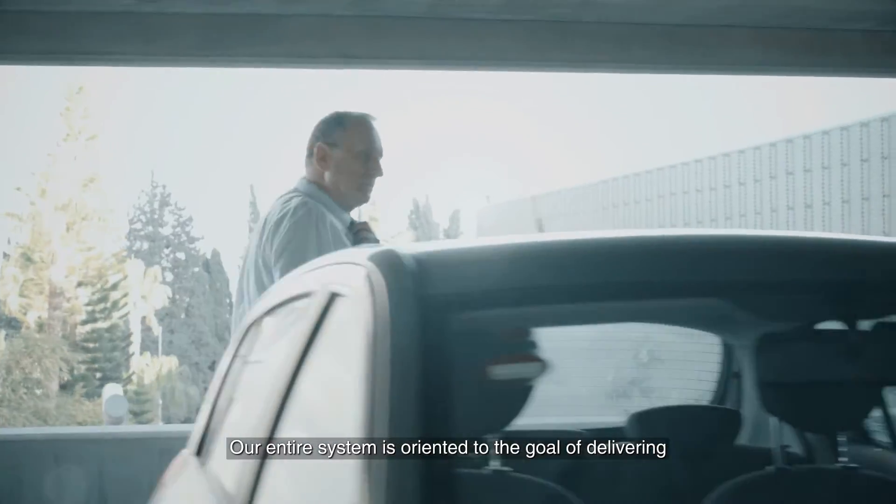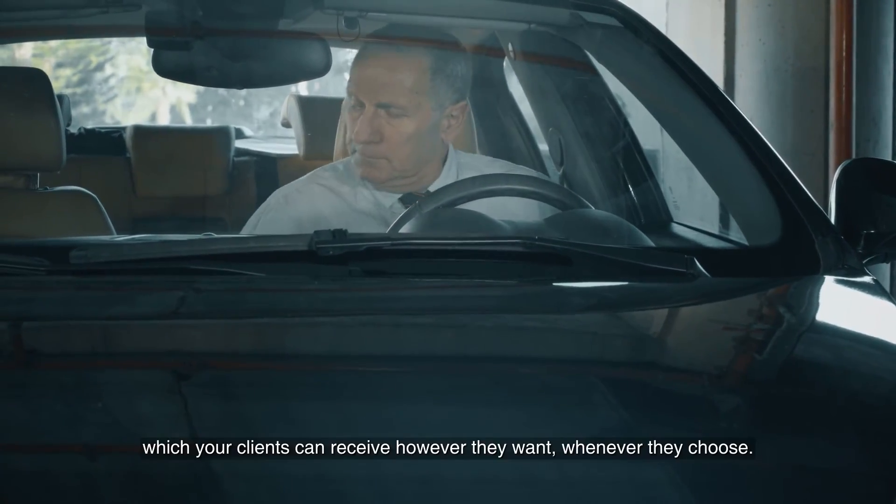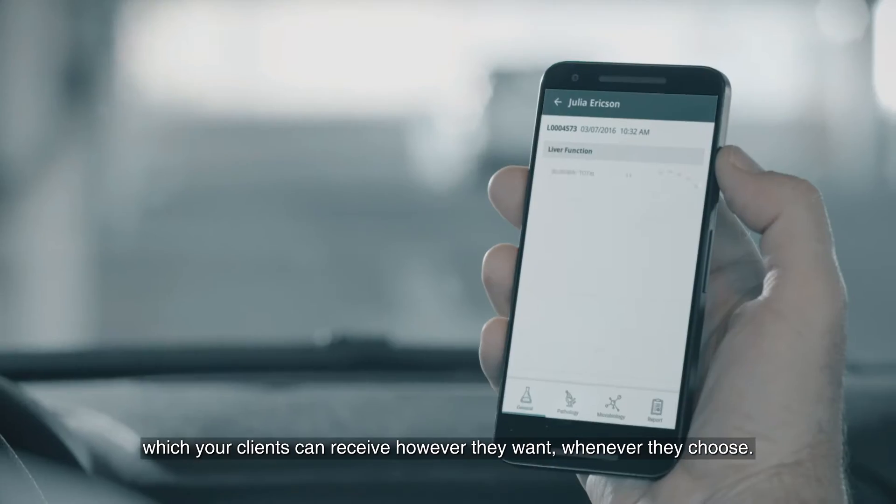Our entire system is oriented to the goal of delivering the most accurate results in the least amount of time, which your clients can receive however they want, whenever they choose.